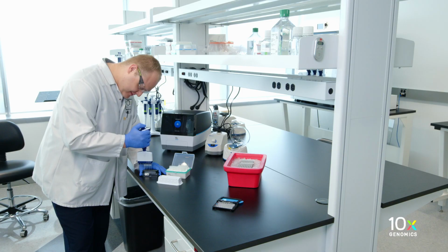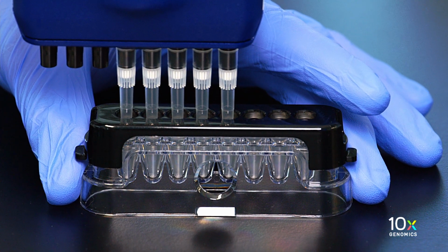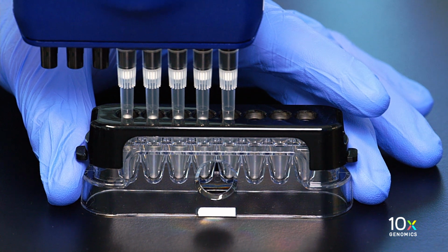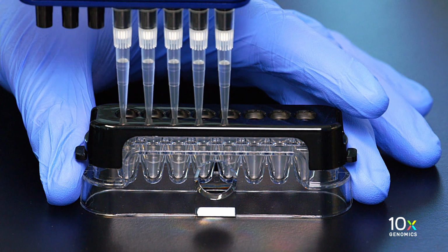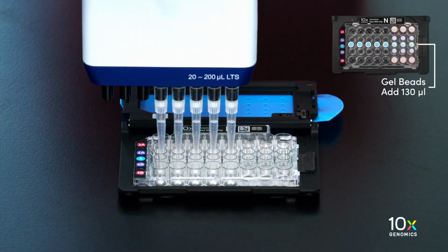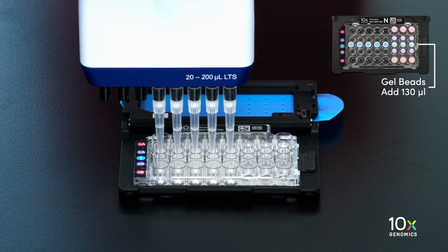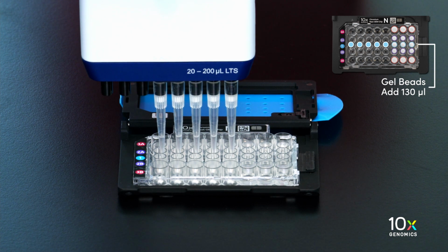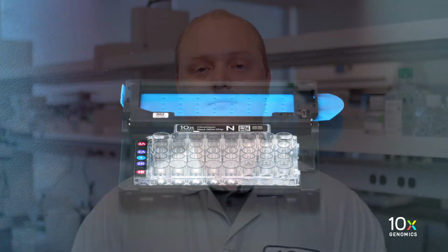Puncture the foil seal of the gel bead tubes. Slowly aspirate 130 microliters of gel beads. Dispense into the wells in the row labeled 1 without introducing air bubbles. Wait 30 seconds. Next, we will load the master mix and single-cell suspension.